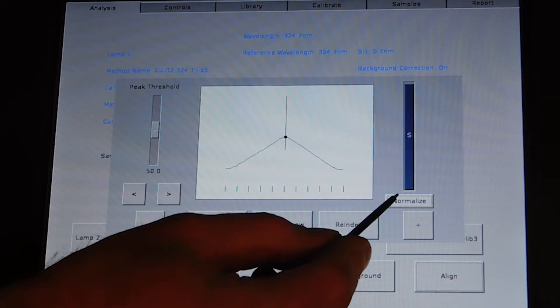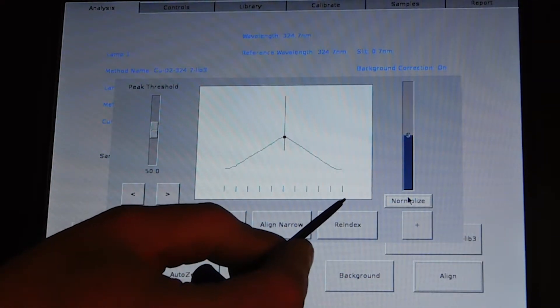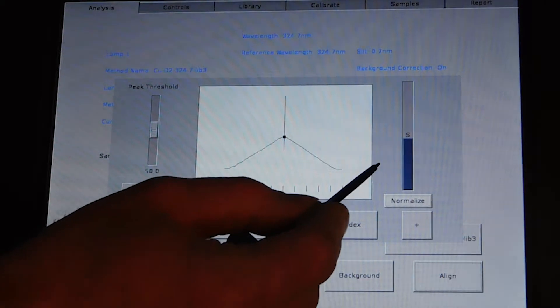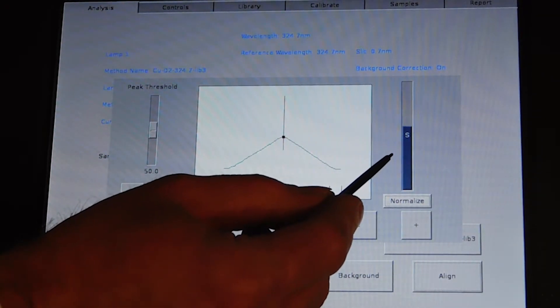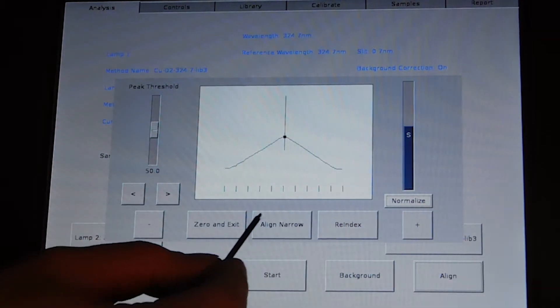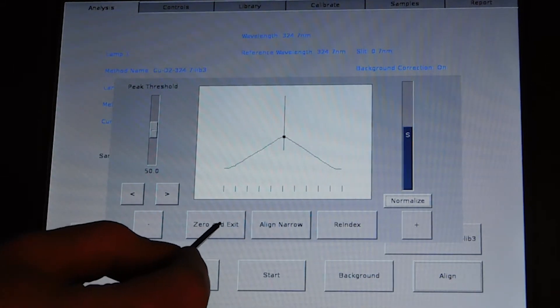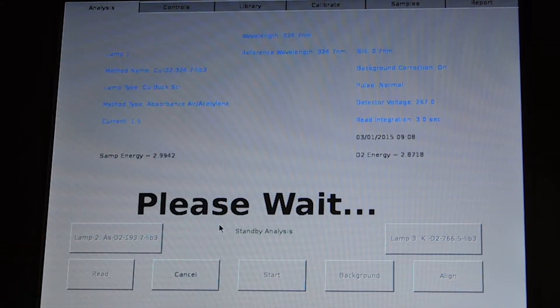But when you're done adjusting it, you will have the highest amount of energy that you can achieve. When you're done, press zero and exit.